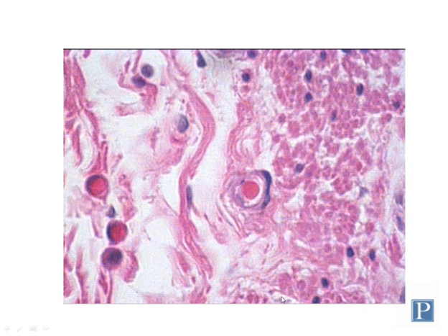In this tissue section you can see several capillaries, these structures here. Capillaries are only about as wide as the red blood cells in their lumen. So here you can see a red blood cell or erythrocyte, and here's the capillary surrounding it. Here you can see a couple over here that are a little bit tighter around the red blood cell. So the red blood cell takes up almost the entire space of the lumen.